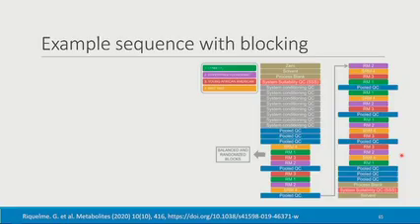Which sample I have from any one class is randomized. So here I've got my SRM and then 3 classes, sorry. But here I've got, from the diabetic sample 1, or class 1, but sometimes they run at the beginning, sometimes they run at the end. The order is all randomized, but within each block, there's one from every class that's there.